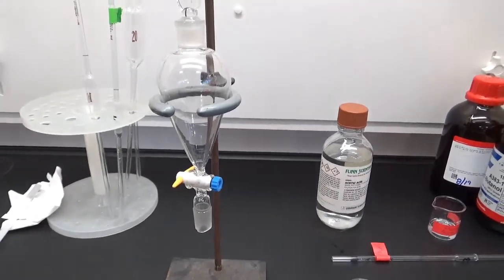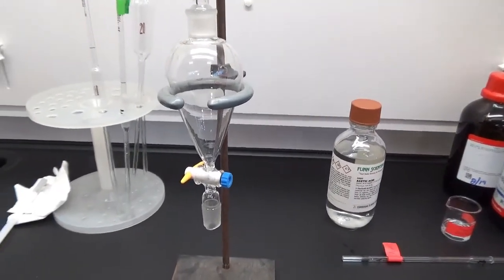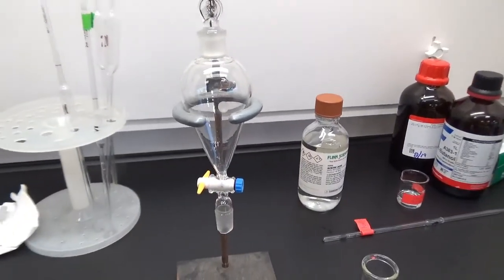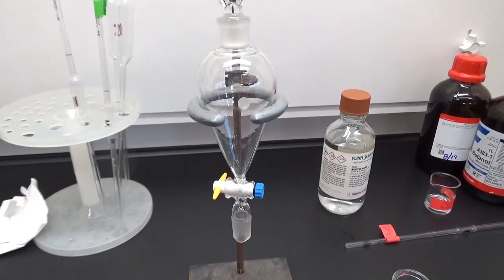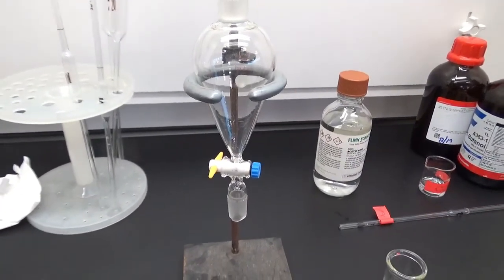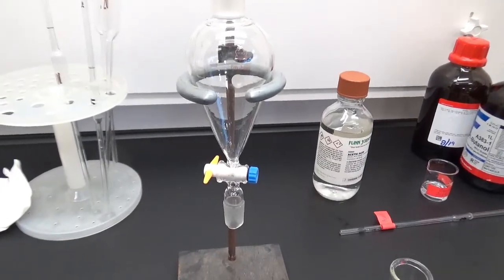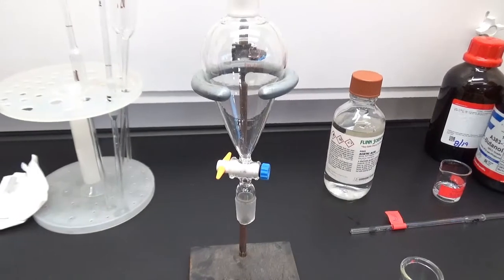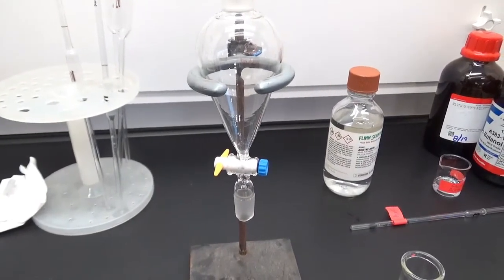All right, how am I going to figure out the composition of each layer? Well, I can figure out the amount of acetic acid in the lower layer. I picked the water layer, right? That lower layer is mostly water. So what I'm going to do is titrate that lower layer with sodium hydroxide to figure out the amount of acetic acid in it.